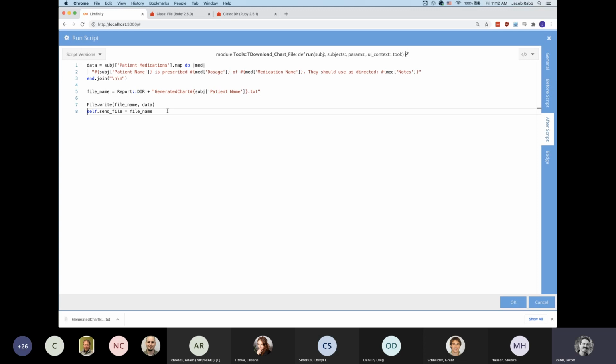This is kind of the old way of showing a user a file, is to let them download it and let them open it using programs that are on their computer. More preferred in modern terms is to let them preview the file in the system. So that's what I'll be showing next. But this example is kind of still handy because sometimes you do end up with files that can't be previewed for whatever reason.